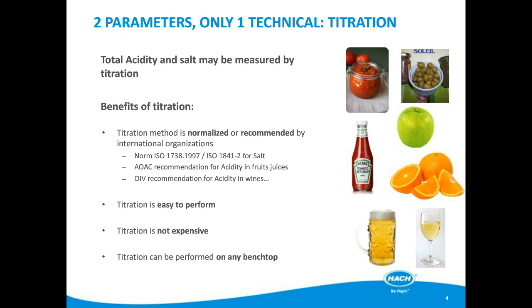And titration is also easy to perform. It's an inexpensive technique and can be performed on any benchtop because it doesn't take a lot of space.